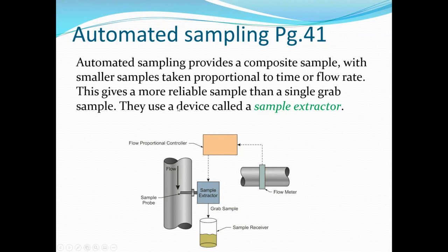But typically they're using a device called a sample extractor, which is an automated sample extracting device that is either driven electronically or by air or by a combination, which basically just goes, plunges in, plunges out, pulls out a specific volume at a set interval.